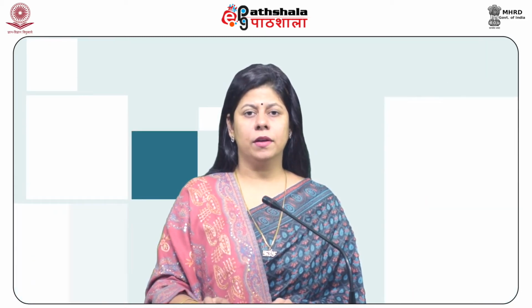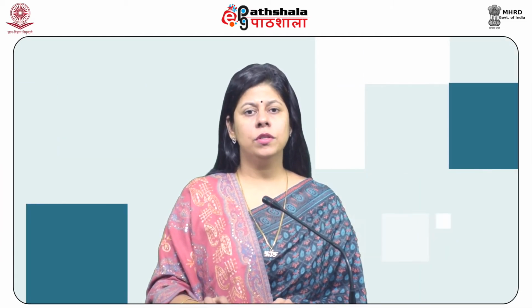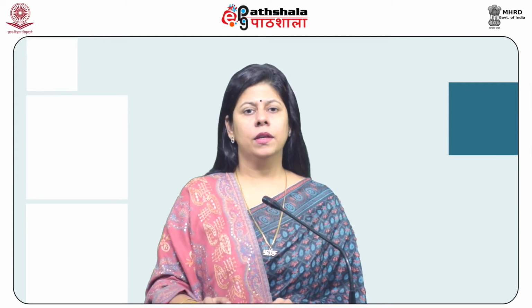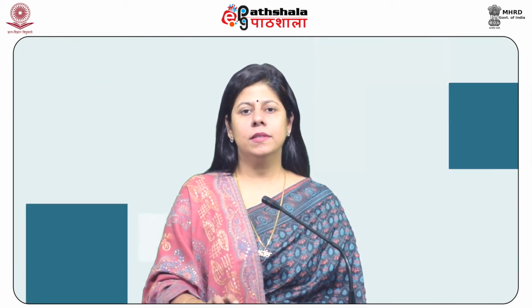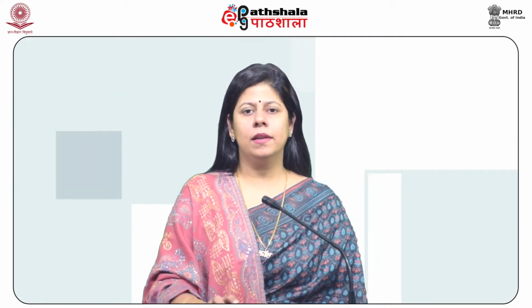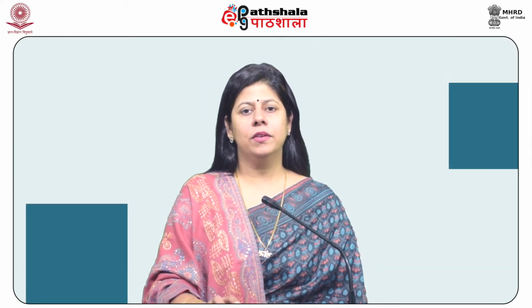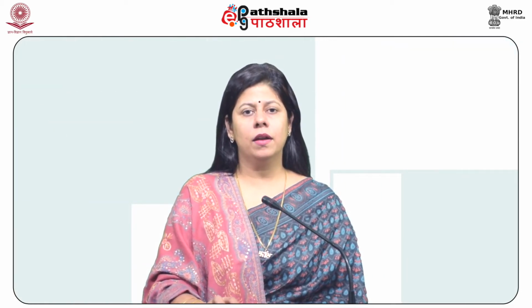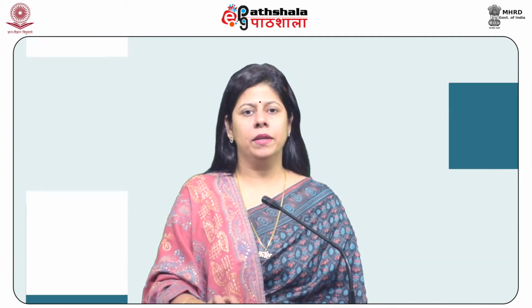NIR reflectance spectra have also been used for the determination of substances in wood, components of polymers and even geological exploration from aircraft. The method is fast and useful in routine analysis. For solid substances, sample preparation is extremely simple. The sample is merely poured into a cell and inserted into the sample chamber of the instrument. The NIR reflectance method really depends on pattern recognition by the computer, and if there are unexpected substances in the unknown, false determinations can be made.